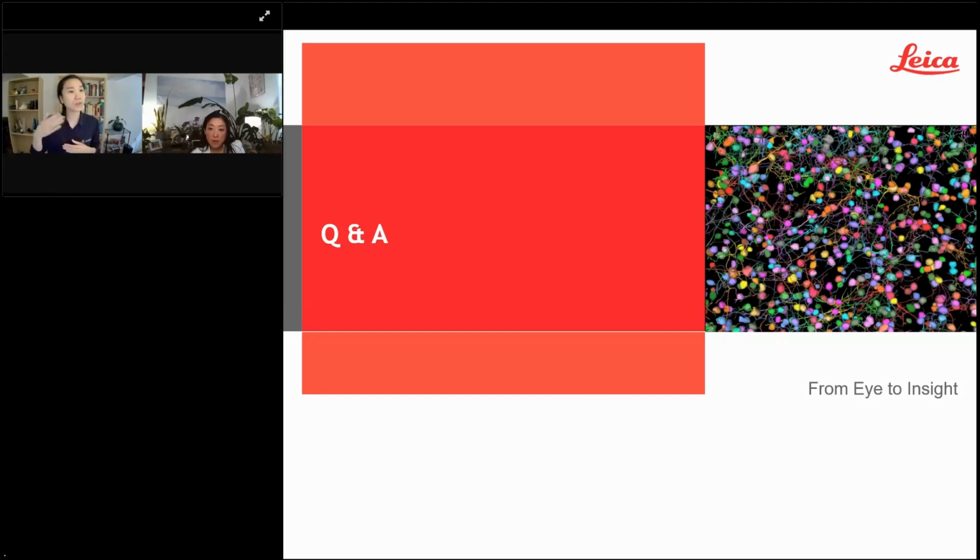You can also add layers on top of that too. So the example I could give here, let's go back to the demo of the Golgi stain. We created those 2 pixel classifiers and then we ran the neuron analysis recipe. You can pair that together and batch it that way too. So it's got a lot of flexibility in the batch application.